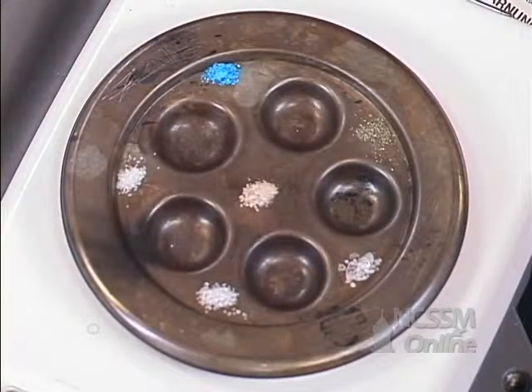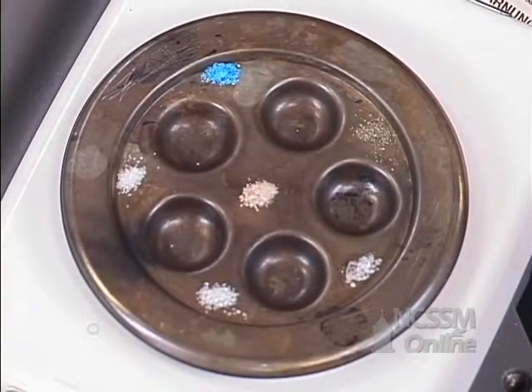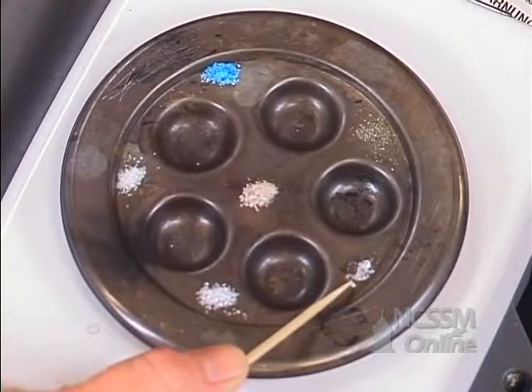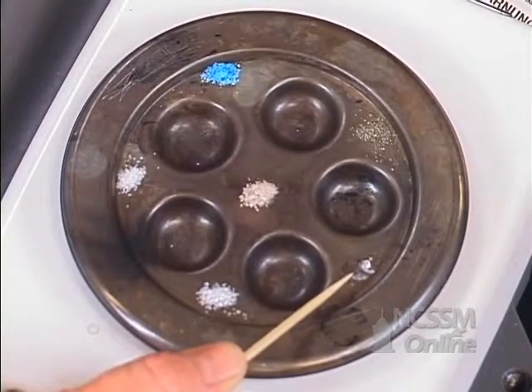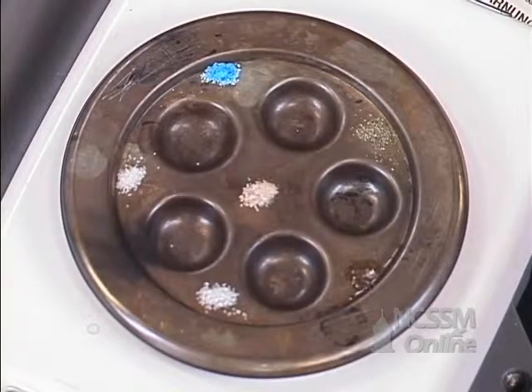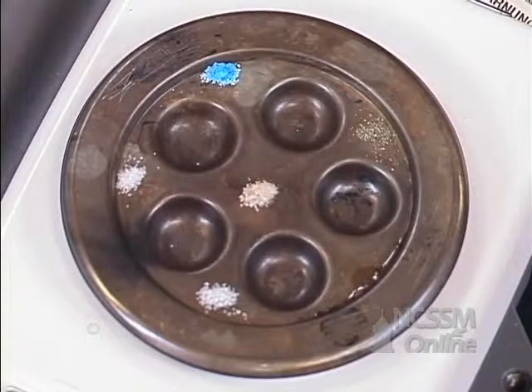I'm going to turn the heat on and I want you to observe what happens. Notice right here, the naphthalene is beginning to melt. It looks like a liquid, but observe what happens — as soon as it becomes a liquid, it evaporates.